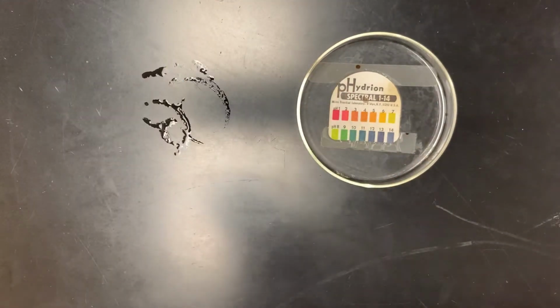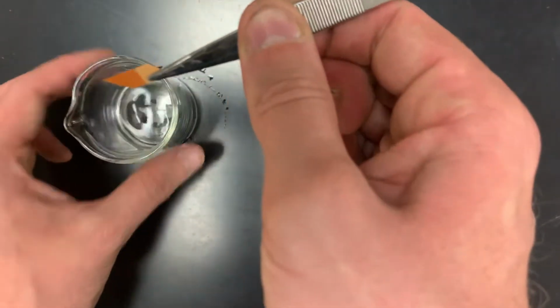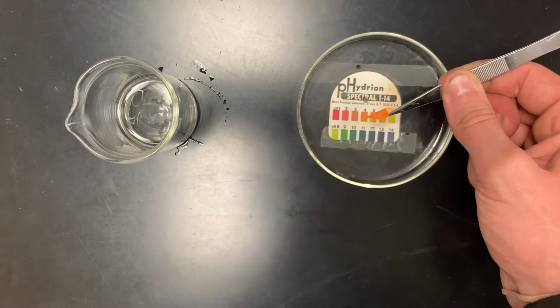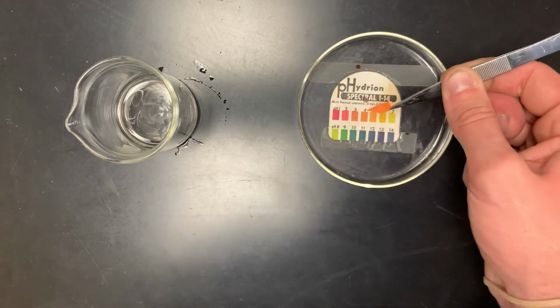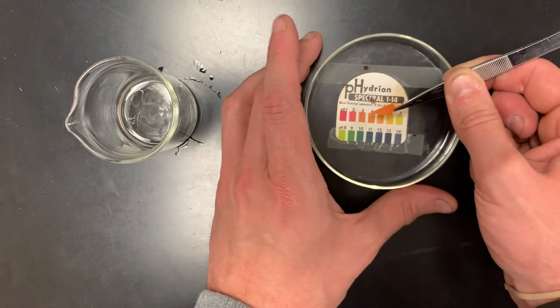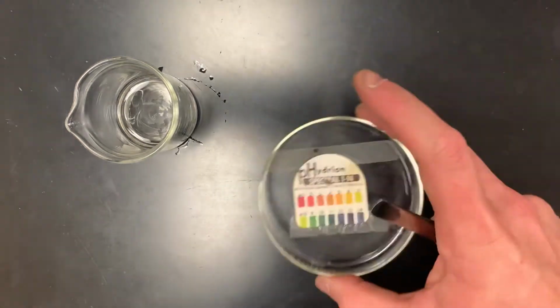We push on to ammonium thiocyanate, our NH4SCN. Let's take a look at that. Okay. I don't know. Again, somewhere between 5 and 6 there. Kind of tough to tell. Actually, maybe creeping down towards 4. Maybe creeping down towards 4 there a little bit. Okay, but again, tough to tell. Maybe in that 5 to 6 region.